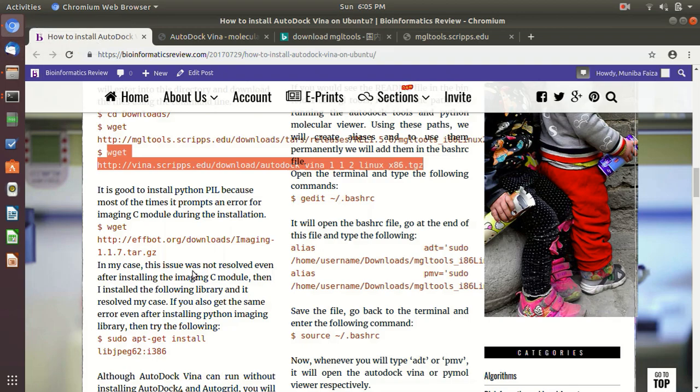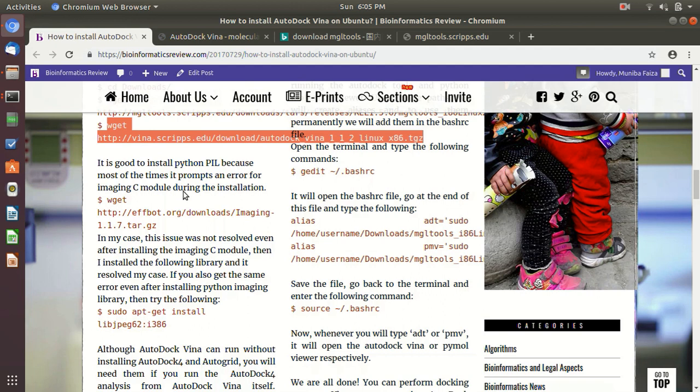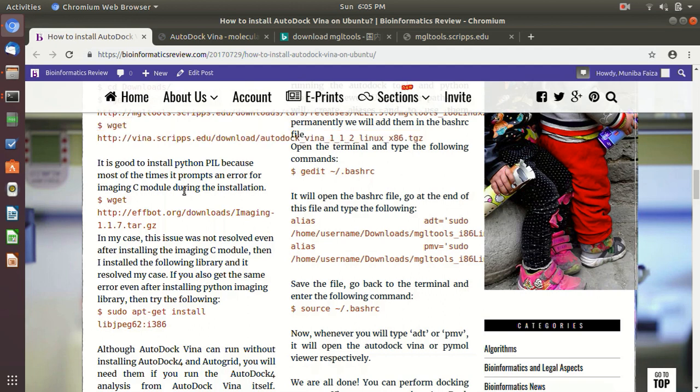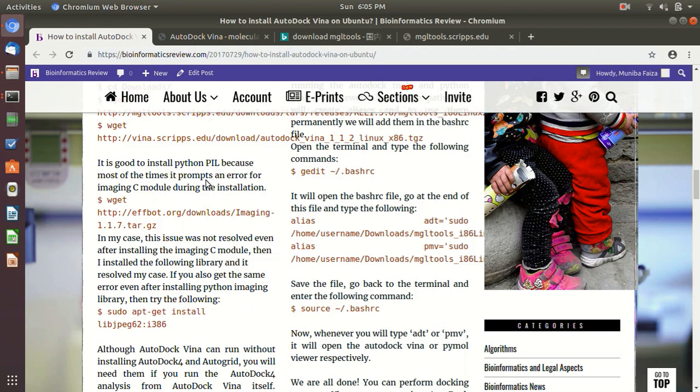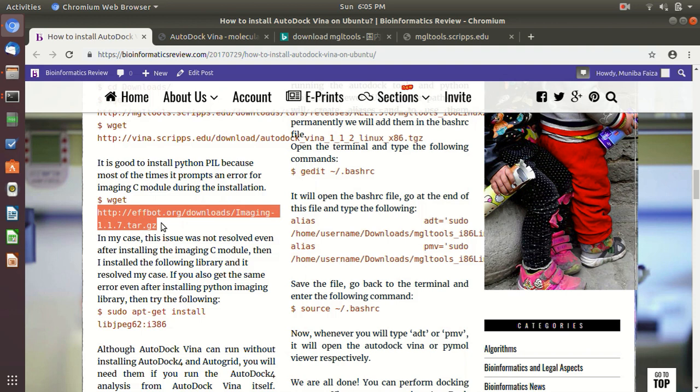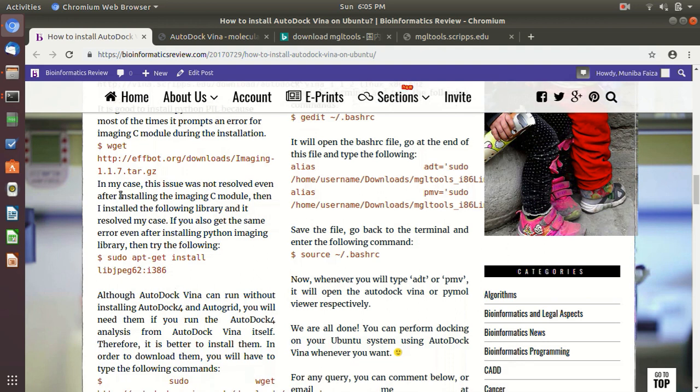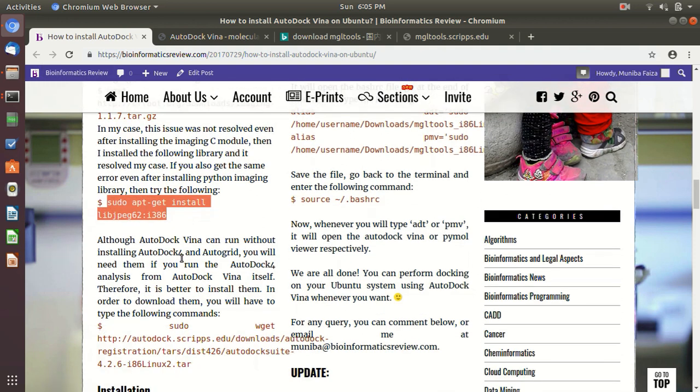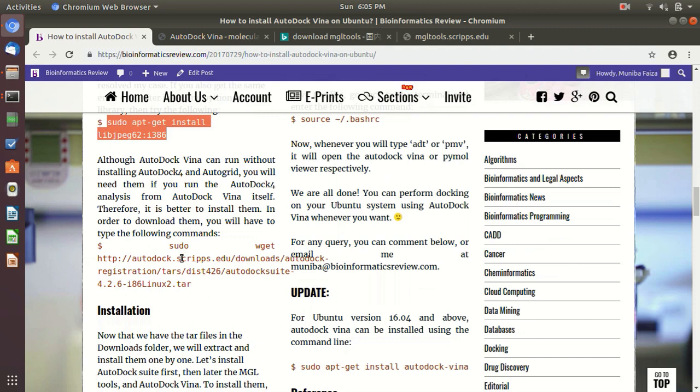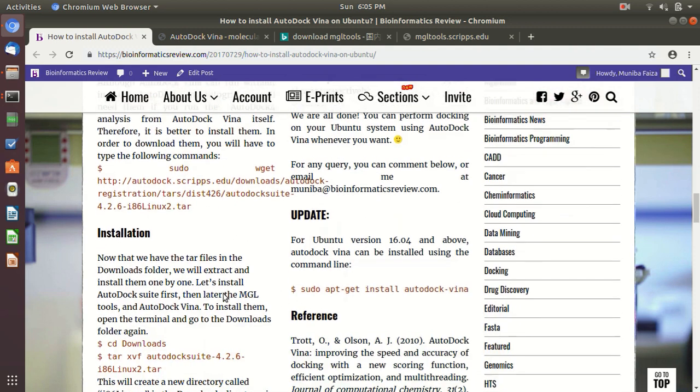Oh yeah, okay, and let me tell you one thing. It is better to install the Python PIL, this library, because most of the times it gives an error for missing imaging C module. So you can download it from this URL, and then just untar it and install it. Or in my case, this issue was resolved by installing this library. So it's better if you download them also first, because later it is going to give you an error.